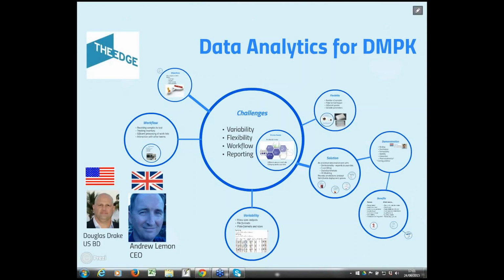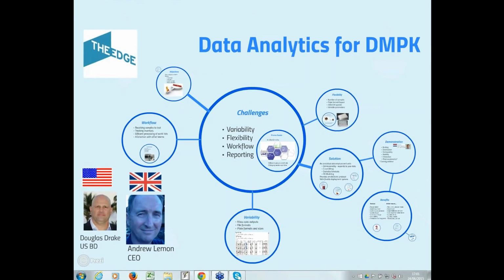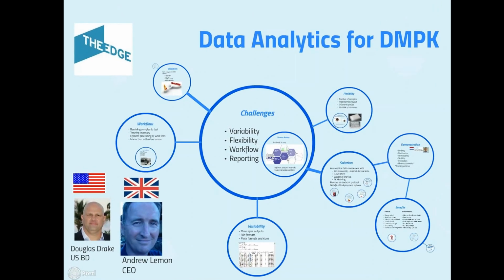Okay, thank you, Doug. I'm very excited for us to talk to you about the data analytics for DMPK, and we're going to review some of the challenges involved with delivery of analytics solutions into the DMPK environment. Peter will demonstrate to you the system, and then finally I'll round up with some of the benefits, and we'll take any questions at the end.